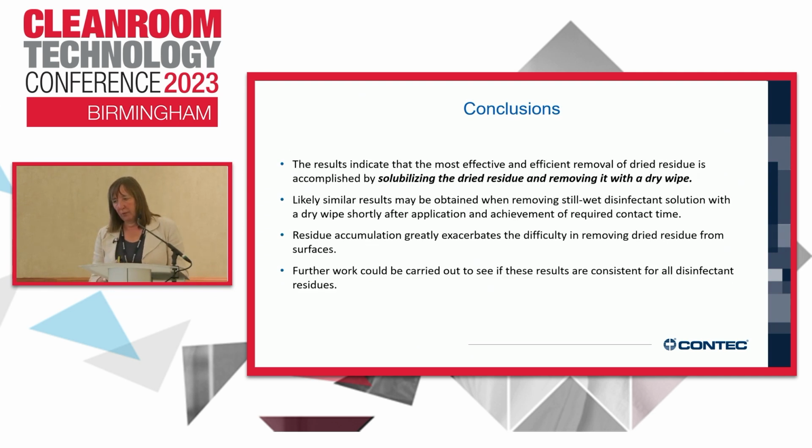The one thing that we took as a take-home from this is that if you've got a dry residue, solubilizing it in whatever way and then removing it with a dry wipe is by far the most effective way to remove your residues. And the main thing is, don't let it accumulate in the first place. Try and wipe to dry after the contact time if you can.